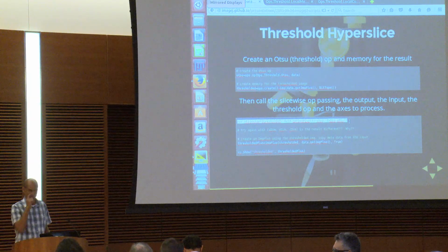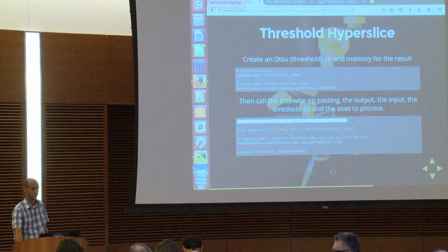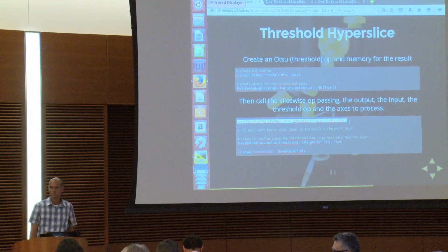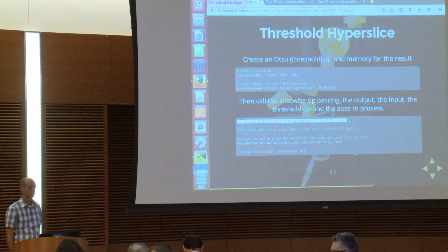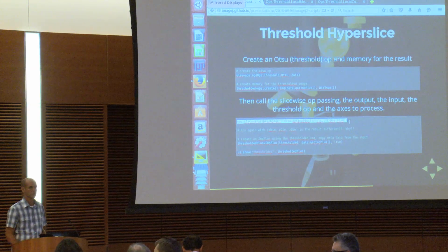So if you write an op that does something fancy to a single pixel, then you can apply that op pixel-wise across your entire n-dimensional image using the map op. So that's a perfect example here. And in order to make map super general, you just have to make sure that whatever operation you pass into map conforms to certain requirements, like defining which input is the one that I'm going to be able to vary.